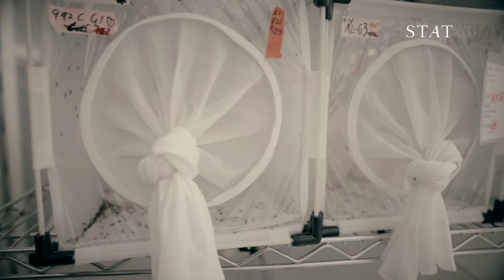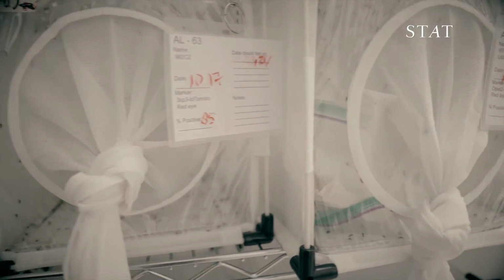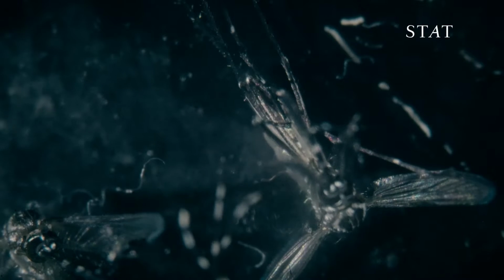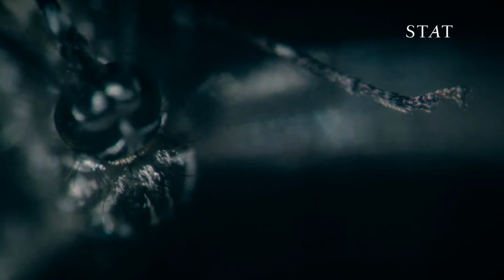And some of the more severe phenotypes, like the triple I mosquito and the mosquitoes that couldn't fly because we knocked out vestigial, we tried breeding them with each other and we couldn't maintain the stocks because they were just really unfit. So we tried to target genes which could be useful for controlling mosquitoes in the future. And we weren't sure what kind of phenotypes we would find because these genes haven't been targeted before in the mosquito. So it was all kind of exploration.